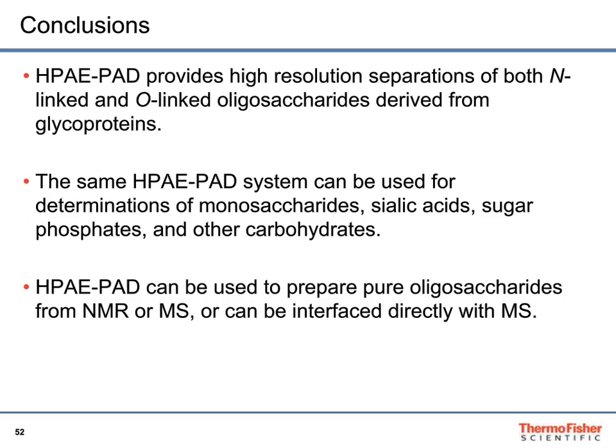So finally, I'd like to just conclude with three statements here. Hopefully I've shown you that we get high resolution of separations from N-linked oligosaccharides. I didn't show you specifically O-linked oligosaccharides, but a couple of the papers I referenced do show that. So it's one technique that can be used for both because we don't have any derivatization.